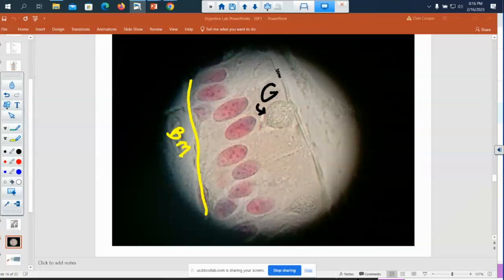You can even, this is what I like too, look how clear those nuclei are. Nice single layer, pretty much. But look, you can even see the line between some of the cells. So that's just, we got really lucky when we had that under the microscope and it showed up like that.